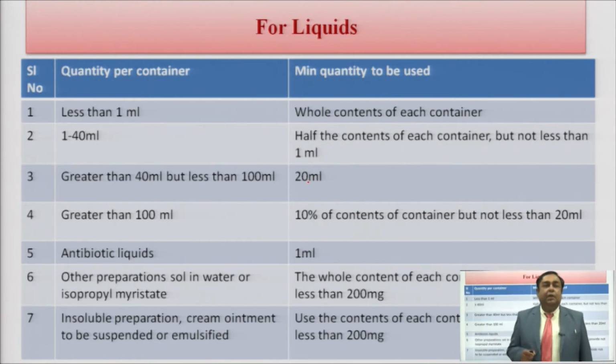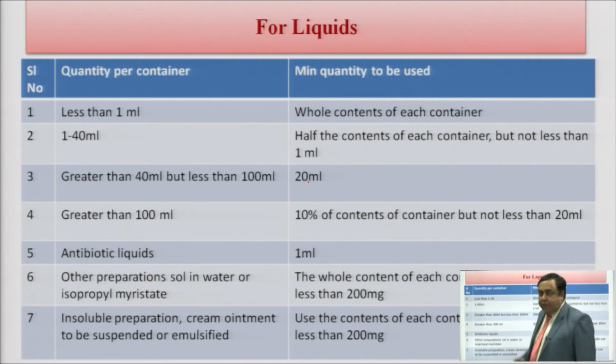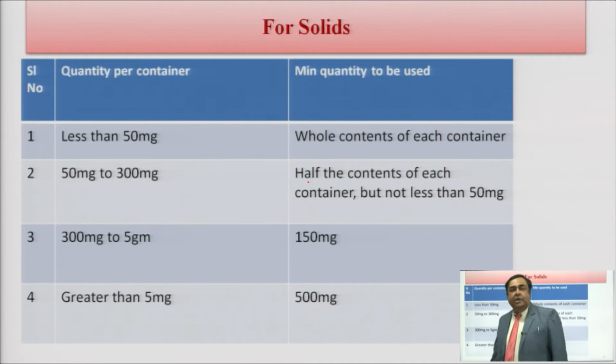That is, insoluble preparations, creams and ointments need to be suspended or emulsified with the help of an emulsifying agent, and IP recommends that you use the content of each container to provide not less than 200 milligram, as told earlier.